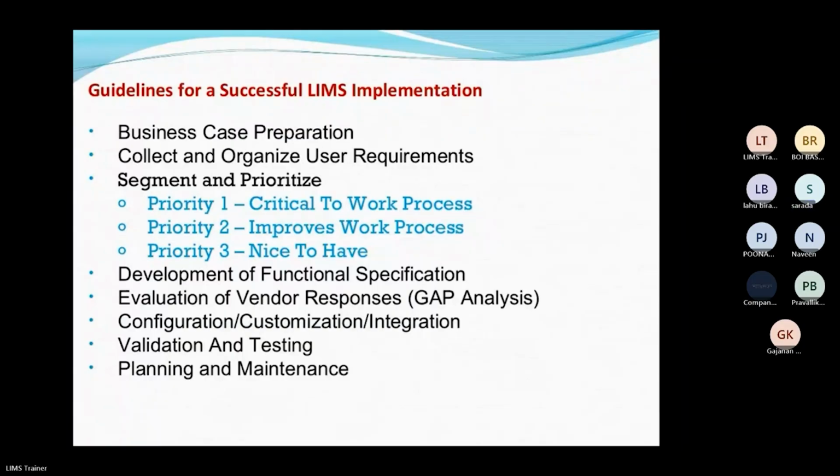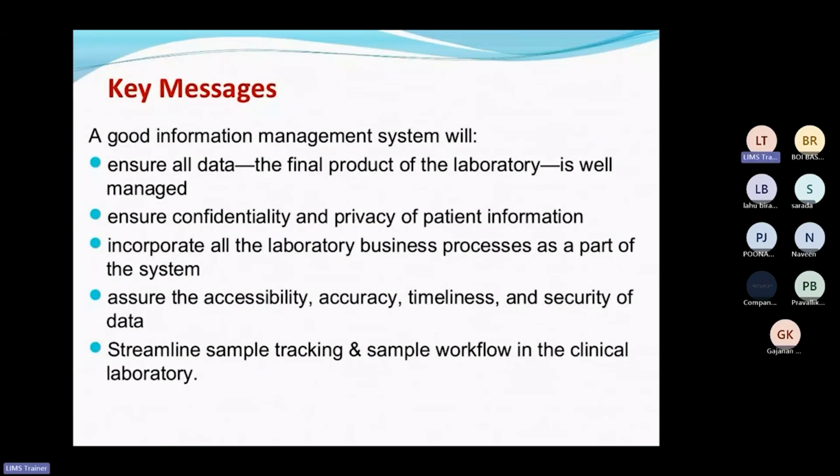Yes. So the information management will be good when all the data generated in the laboratory is ensured, then it is good information management. It ensures the confidentiality and privacy of patient information. This is related to clinical trials. In clinical trial laboratories, the data is confidential, and there should be no leak of that particular patient information. So this functionality is provided by the software.